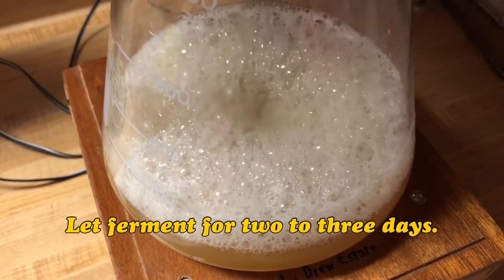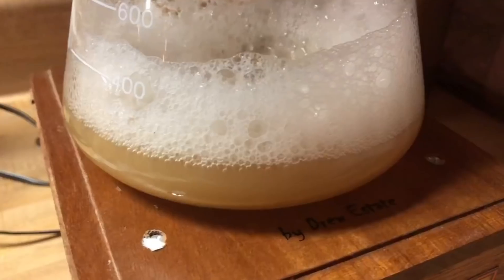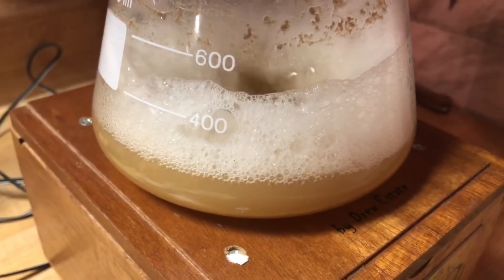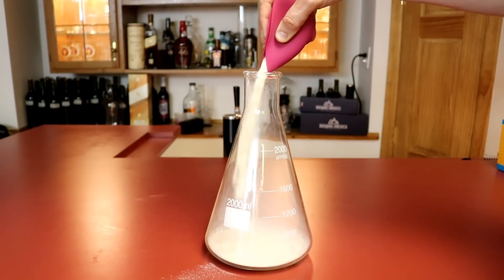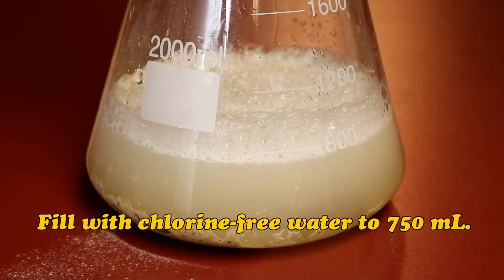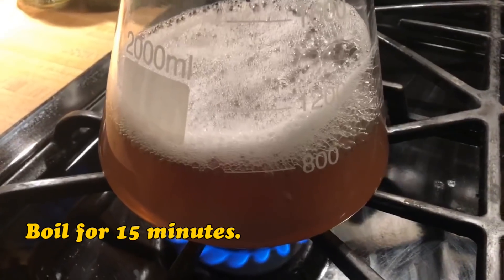Now we just wait. This first starter took a couple of days to complete. I knew it was done when the foam receded and it was ready for the next step. I weighed out 40 grams of dry malt extract and added it to a new flask or other vessel if you don't have a flask. Then I add 750 milliliters of chlorine-free water, put it over the stove, and got it to a boil. I let that cool.